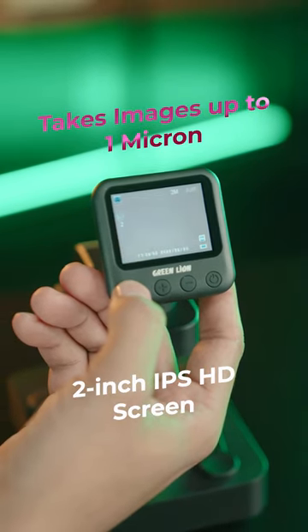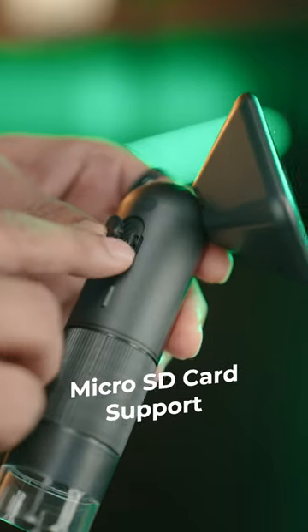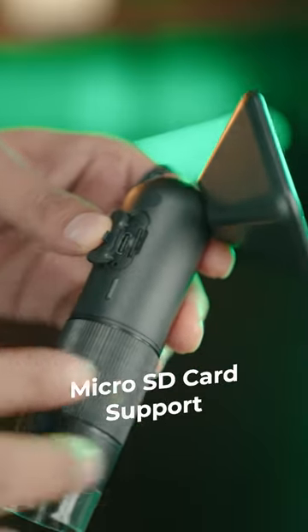With its 2-inch display screen, you can easily view the image. You can also take videos and photos by inserting a micro SD card.